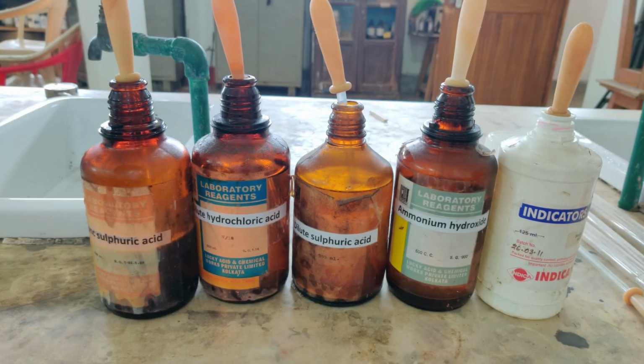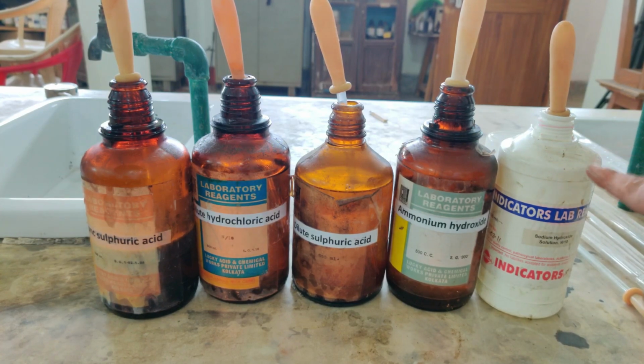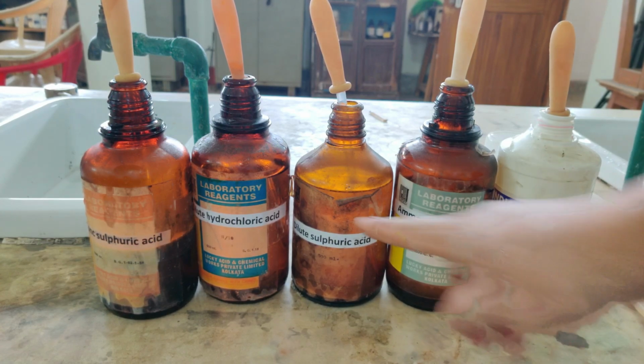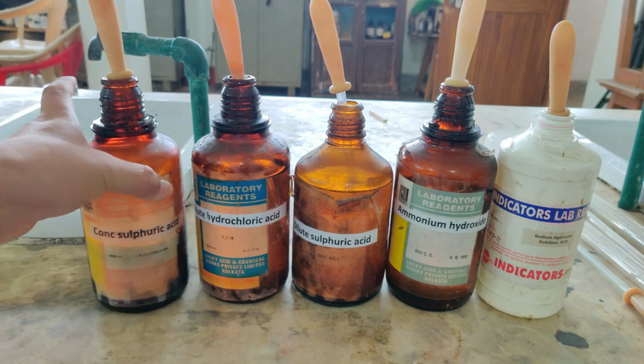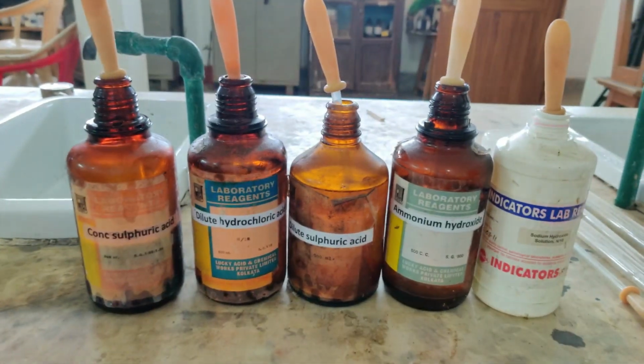Now let's do the test with the universal indicator. You can test as many solutions as possible, but in front of you I have taken 5 different solutions. The first one is sodium hydroxide. The second one is ammonium hydroxide. Both of these are bases. Then the next one is dilute sulfuric acid. Then we have dilute hydrochloric acid, and finally concentrated sulfuric acid. This is concentrated sulfuric acid. This is dilute hydrochloric acid. This one is also dilute sulfuric acid.